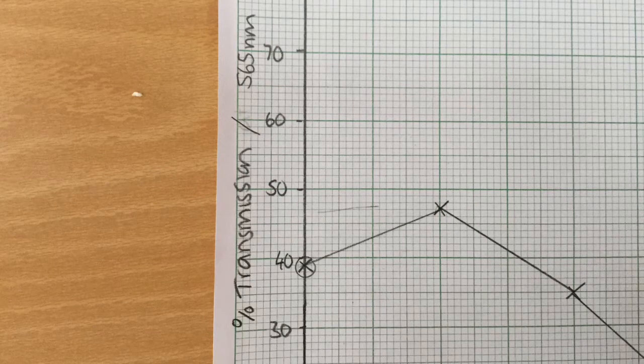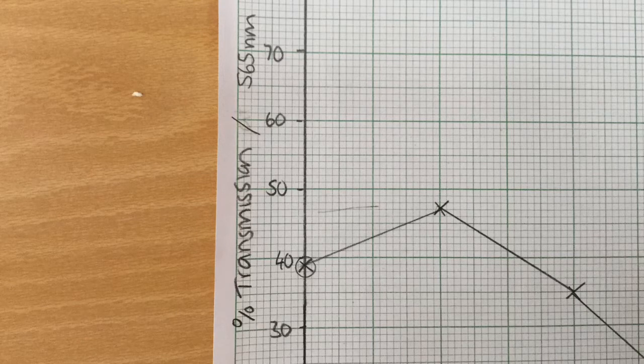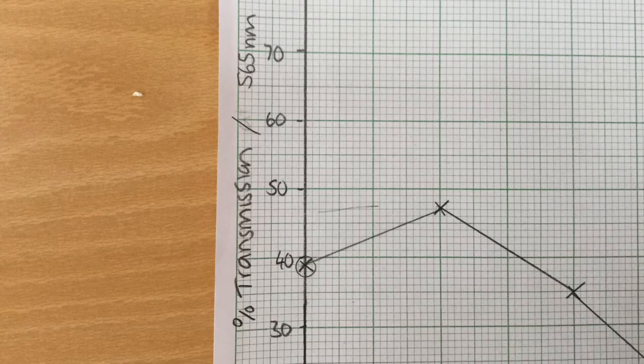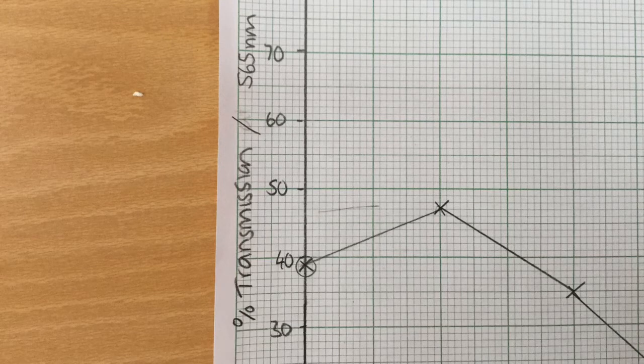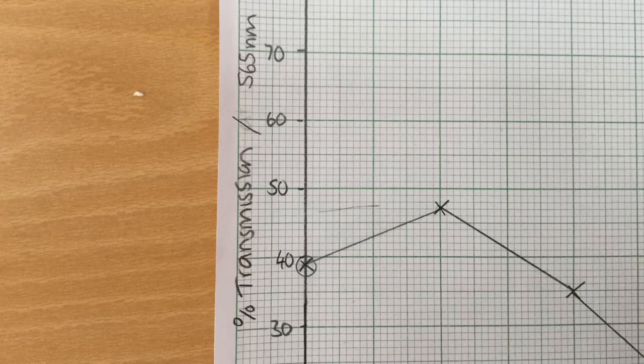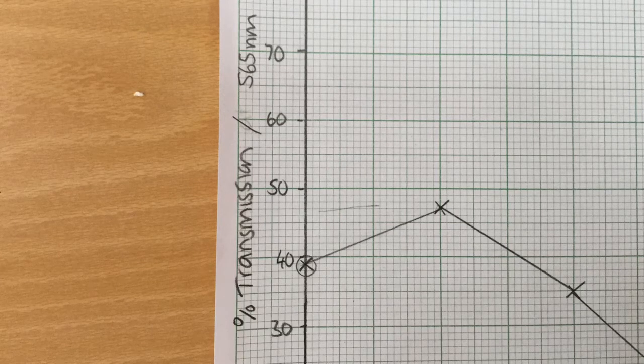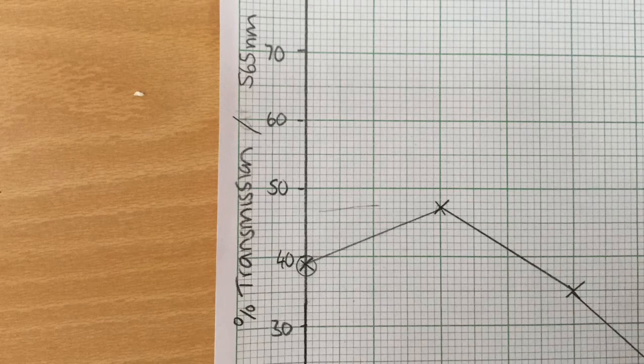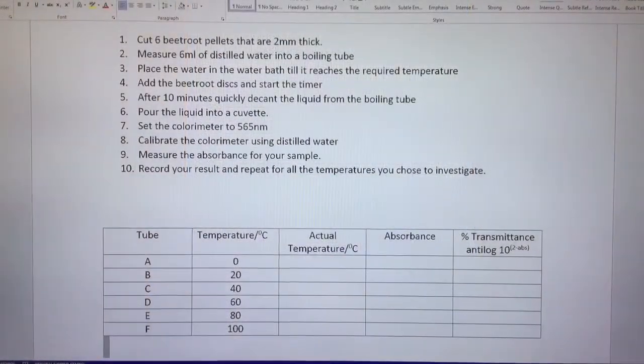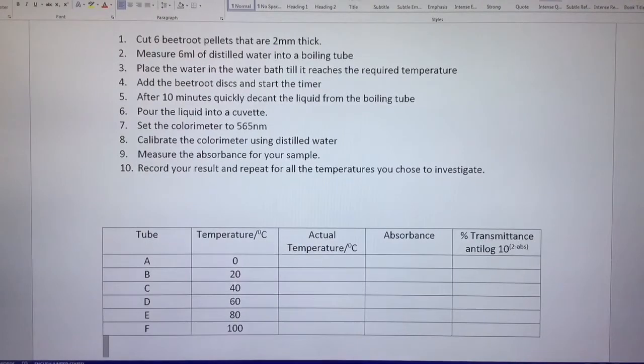In the worksheet that you used, I've included a column there for actual temperature because, of course, while a water bath may be set at 40 degrees or 60 degrees, the actual temperature of the water in there without the lid on may differ. And in terms of producing our curve to get the best possible curve, we want to make sure that we plot the points that we actually have.